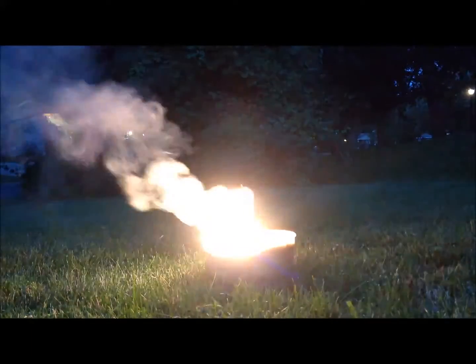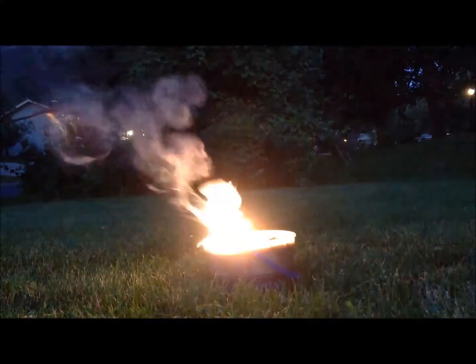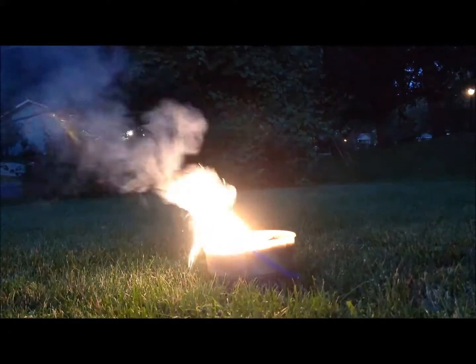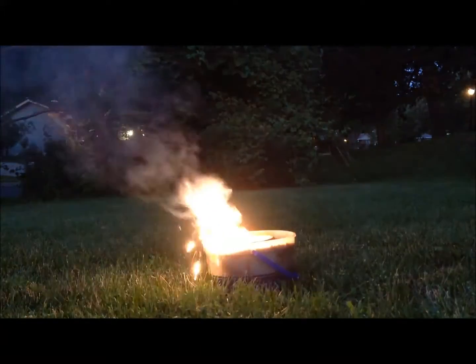My manganese dioxide was from alkaline and dry cell battery paste, washed with water, and then baked and ball milled to a fine powder. I should have ended up with molten manganese metal under molten aluminum oxide, but instead I got a coarse, dirt-like material that did not have any coalesced lumps of metal inside it.